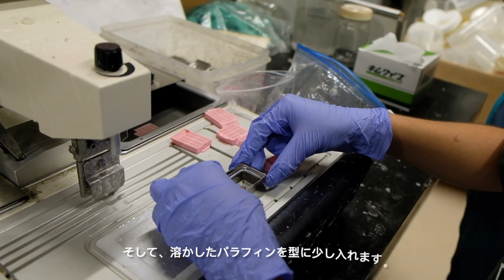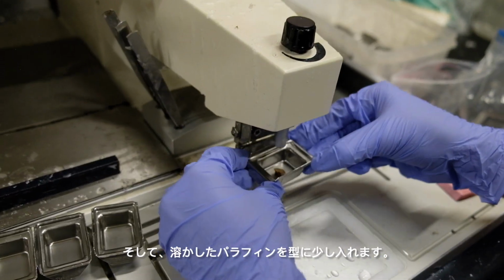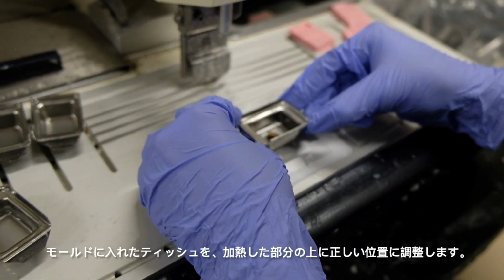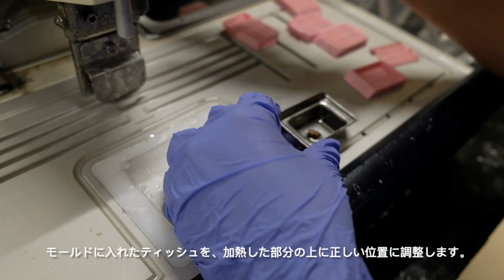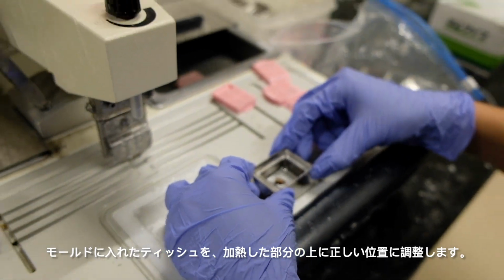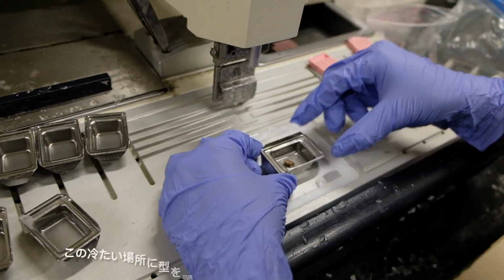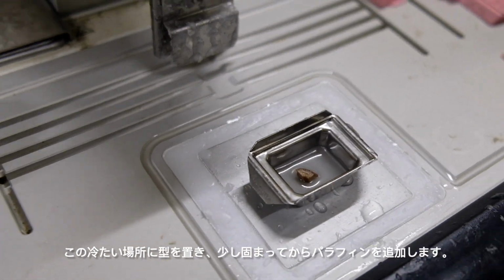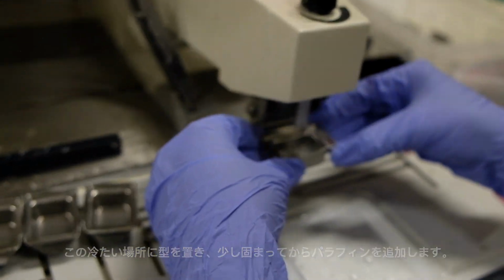We will then put a little bit of paraffin, melted paraffin, in it, just enough to cover the bottom, and put it in the heated area so you can still move it around and the paraffin remains melted before transferring it to this little spot that cools it down. And we'll wait for the paraffin to solidify slightly before adding some more in.